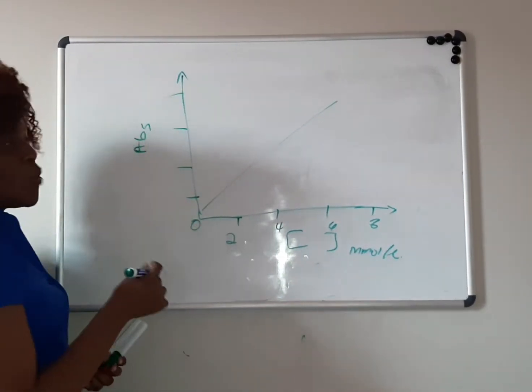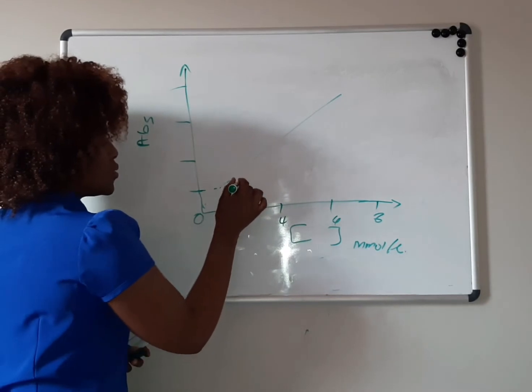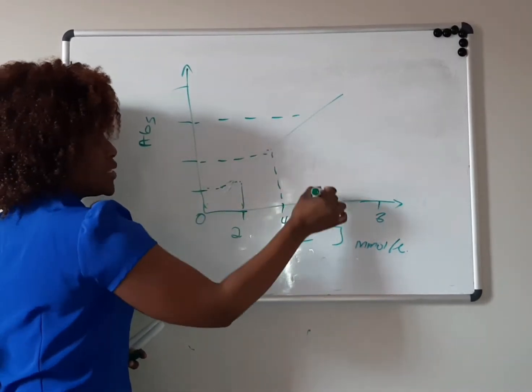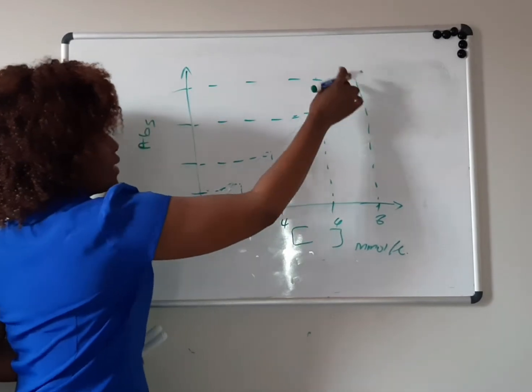And then the absorbance is what we got on the spectrophotometer when we were testing these different concentrations of the standard.